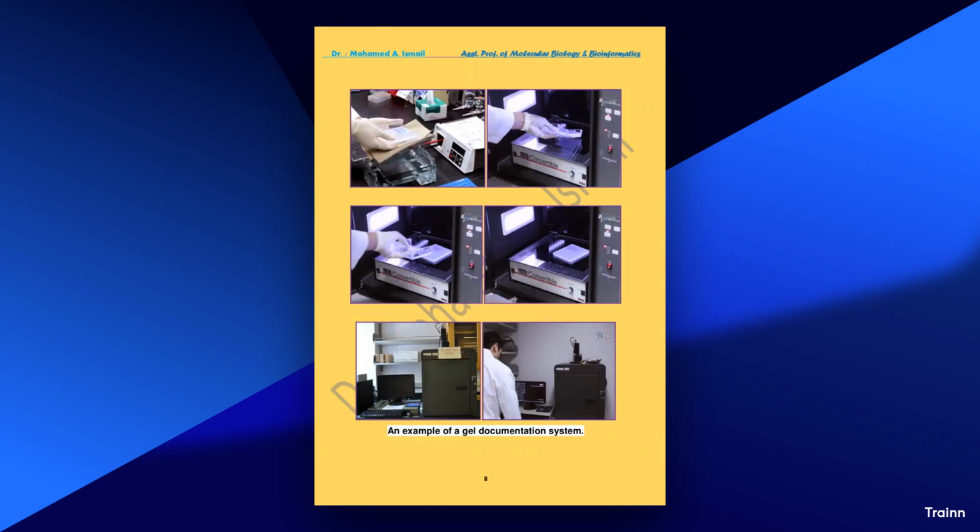Detailed overview of errors in the investigation of figures from agarose gel electrophoresis of PCR products. Analyzing the figures obtained from agarose gel electrophoresis of PCR products is crucial for determining the success and specificity of the amplification process. However, various errors can arise during this analysis, leading to misinterpretation of results. Below, I detail common issues such as primer dimers, primer hairpins, RNA contamination, and other mistakes, along with references for further reading. 1. Primer dimers.